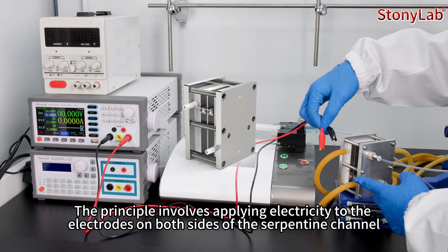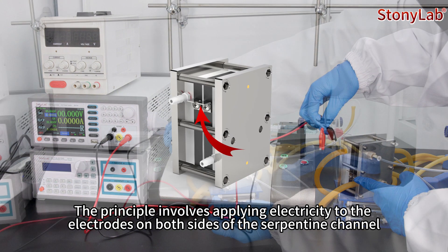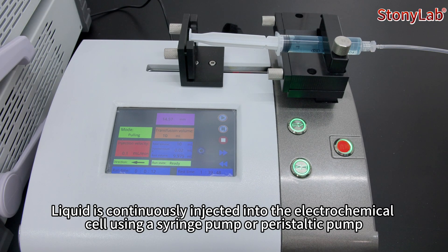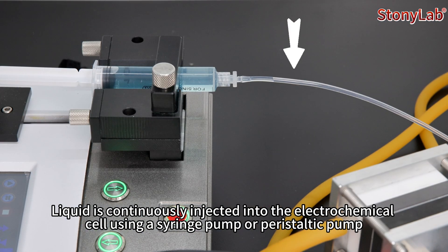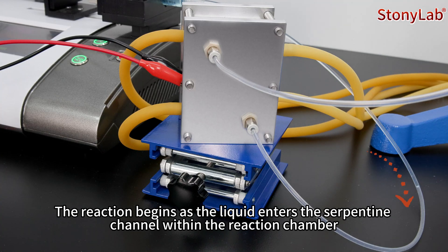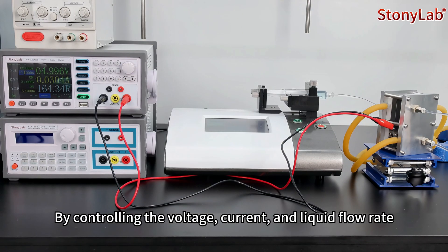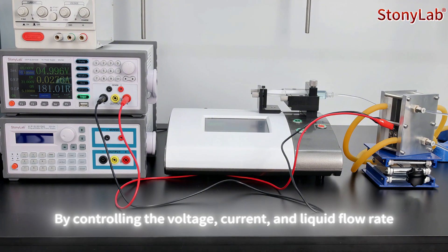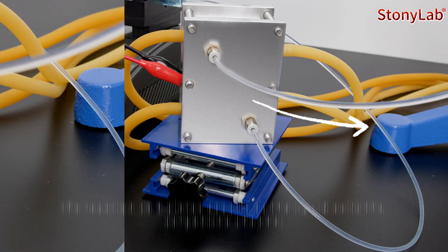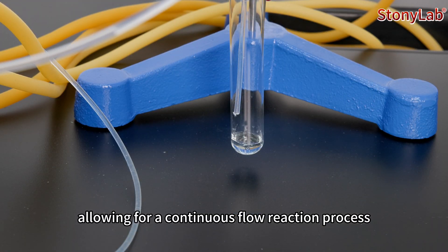The principle involves applying electricity to the electrode on both sides of the serpentine channel. Liquid is continuously injected into the electrochemical cell using a syringe pump or peristaltic pump. The reaction begins as the liquid enters the serpentine channel within the reaction chamber. By controlling the voltage and liquid flow rate, the reaction completes exactly as the liquid exits the serpentine channel, allowing for a continuous flow reaction process.